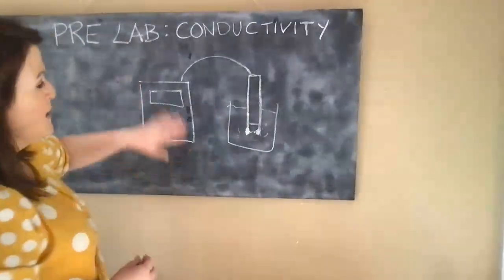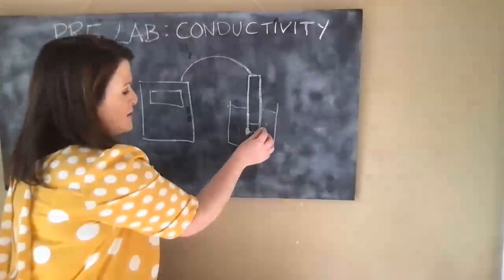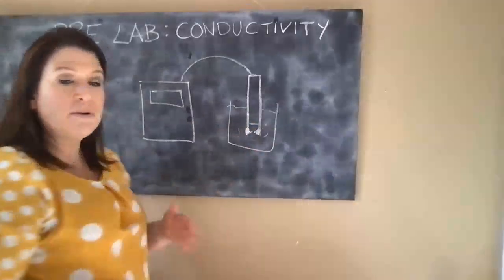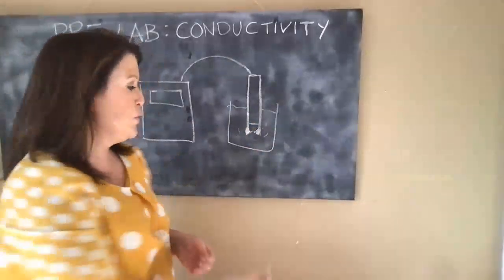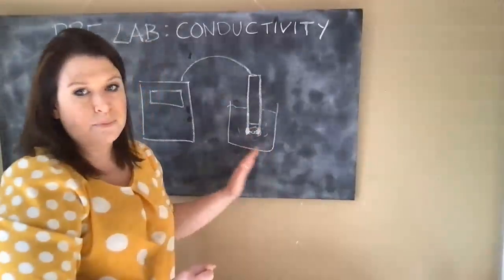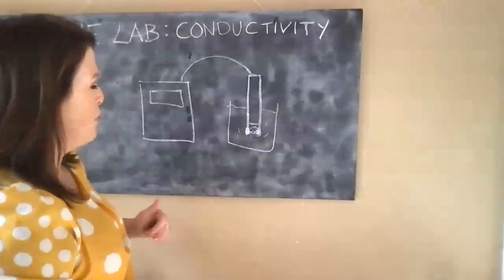But for the minute, one of the first tips to notice is that, because this is hollow and about a centimetre wide, in between each solution or each test you do, you thoroughly rinse that area so there are no residual ions left from a previous solution going through. That's really shown to you in the videos that we're talking about.